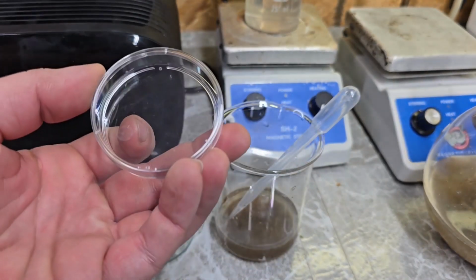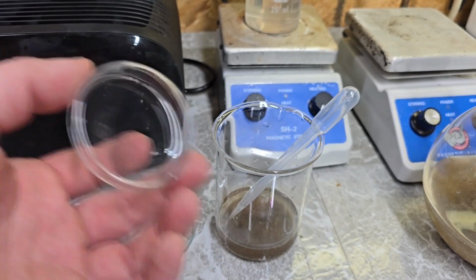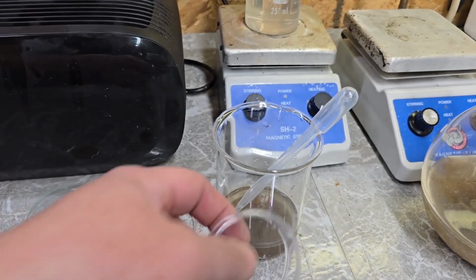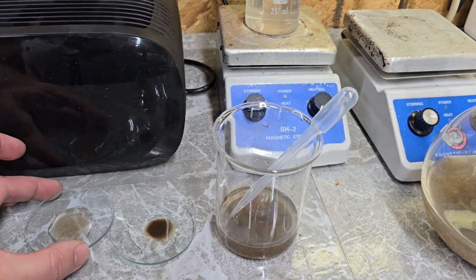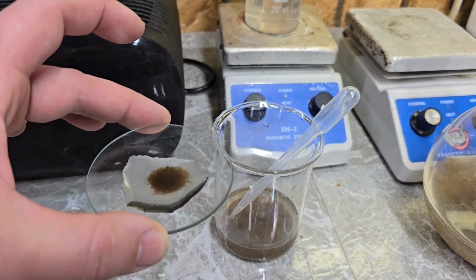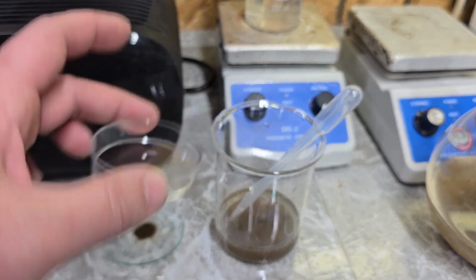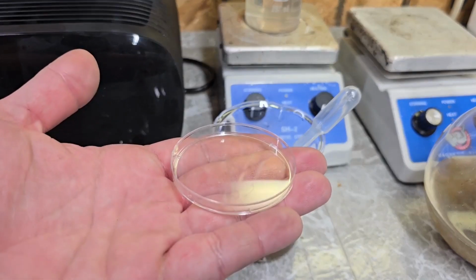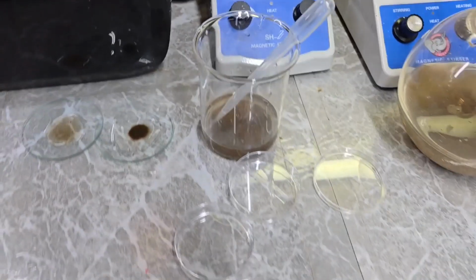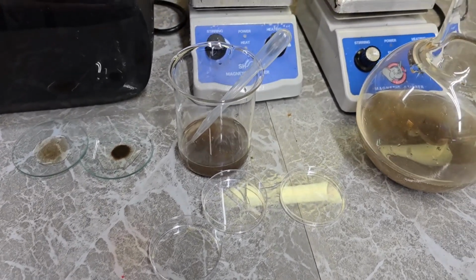All right, I think I'm actually going to use these little 60mm Petri dishes. These were already opened and exposed to the air, so I don't care if I contaminate them with this water. I looked at one of these watch glasses under the microscope, but since it's a concave surface, all this stuff pulls into the middle and makes it really dense and difficult to see into. With the Petri dishes, the bottoms are completely flat, and I can invert the lids and use them too. So 2 Petri dishes gives me 4 little containers. I'm going to use these instead of the watch glasses, just for ease of use and more consistency.